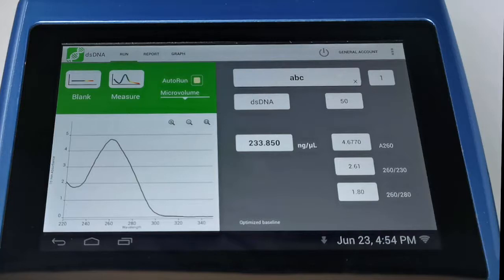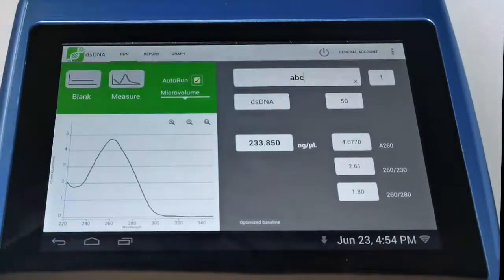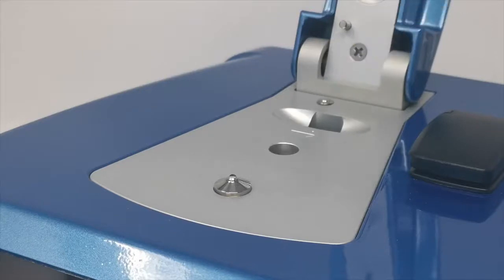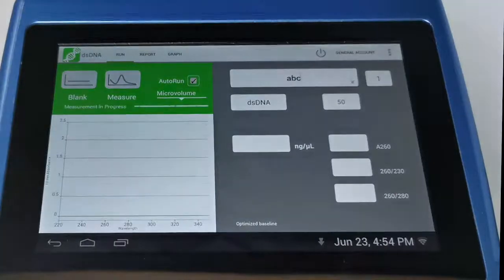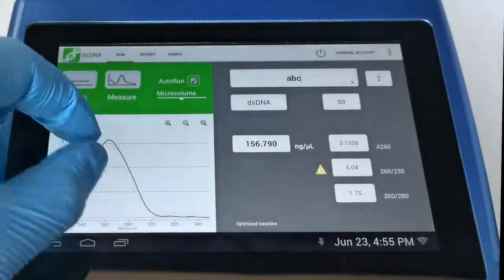So what I'll do is I'll just run another sample, and I'll just show you how the auto run works. So we'll select the checkbox that gives us auto run, and I'll just load another sample on, and you'll see that will automatically measure. And with this sample, we've deliberately set one up so that it will show us contamination. So this is a sample that is contaminated by DNA extraction salts.